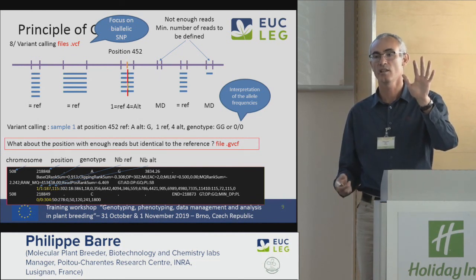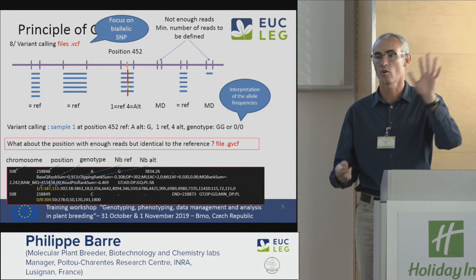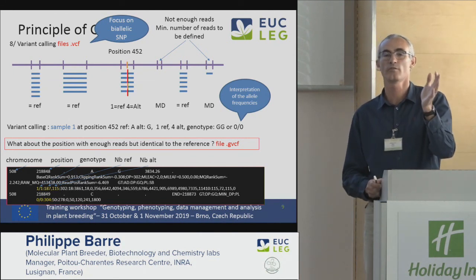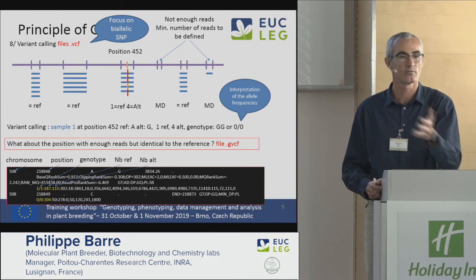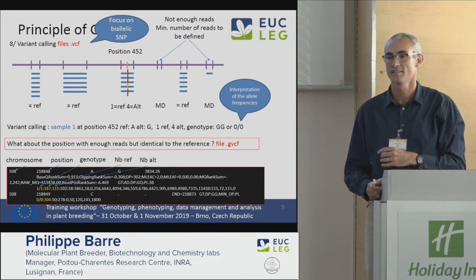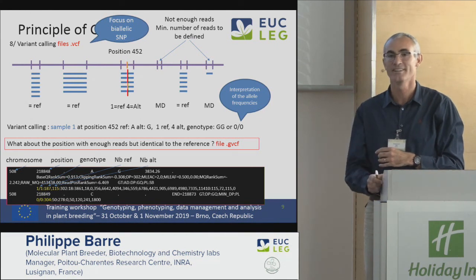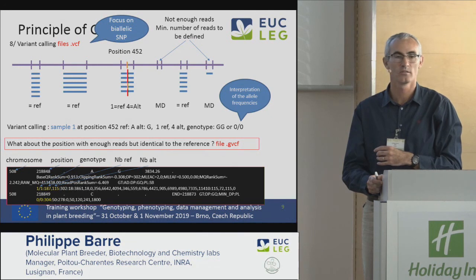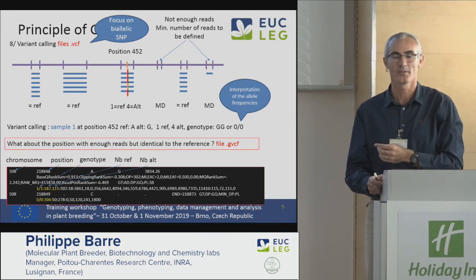Do you think it's enough information to say it's homozygous, heterozygous? Who would call for a variant with 5 reads in the room? So you can raise your hand. So, yeah, you call for a... Yeah. So the others, they don't want to... No, you wouldn't. No, okay.